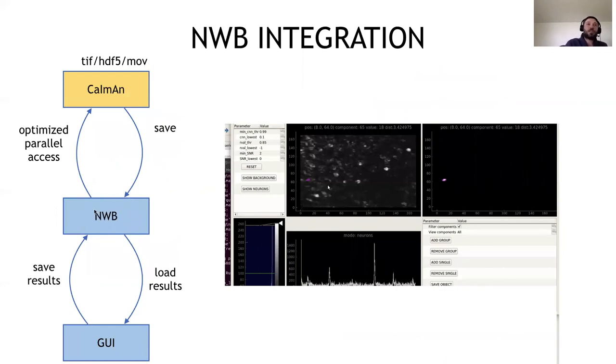And finally, once we have this NWB file, we have a very basic visual interface that allows to load the results, select a subset of traces that we are happy with, and then save them again in NWB format. And then, so if you want, you can load them again in the future. Importantly, you will be able to save these components now organized into accepted, rejected, or still not processed. So it gives you in some sense, a little bit of flexibility and you can read this directly from the NWB file.